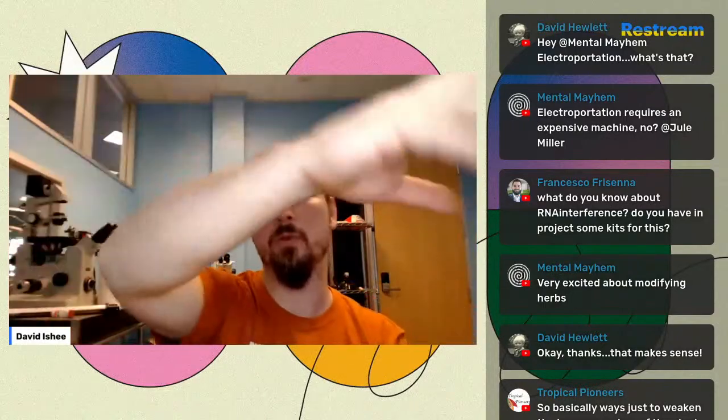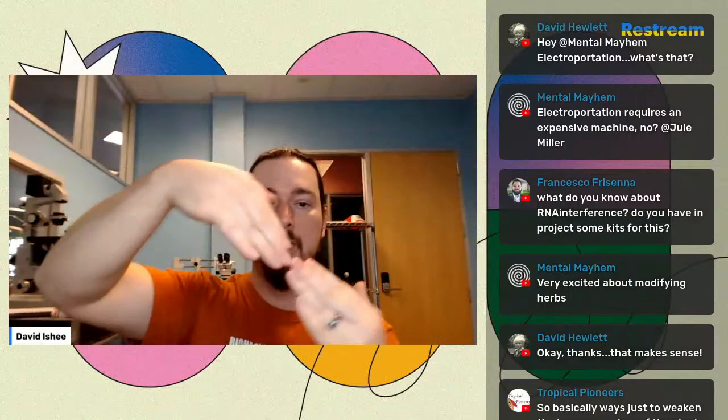When you put them in an electric field, there's an electrical gradient, and that causes those molecules to rearrange themselves. Instead of a repeating pattern that makes a layer, they arrange themselves into pores. It's kind of like when you put a bunch of rice on a plate and play a tone into it, and it arranges itself into these patterns depending on the vibrations.